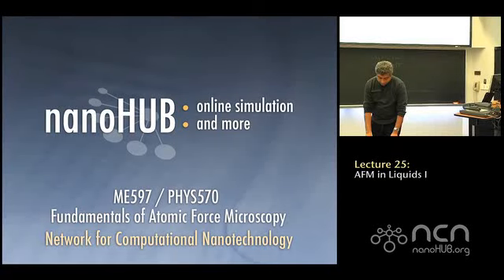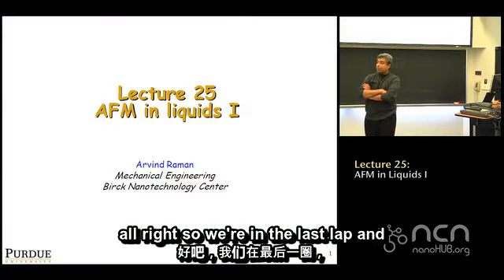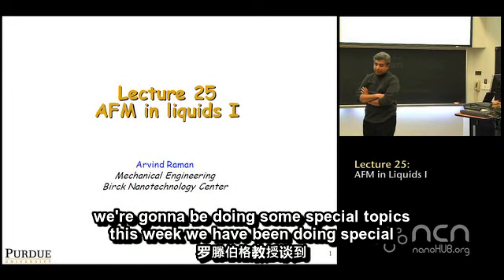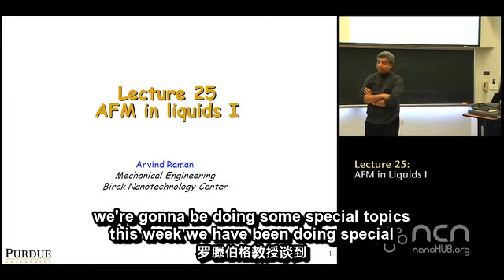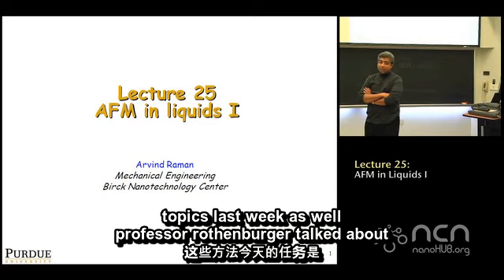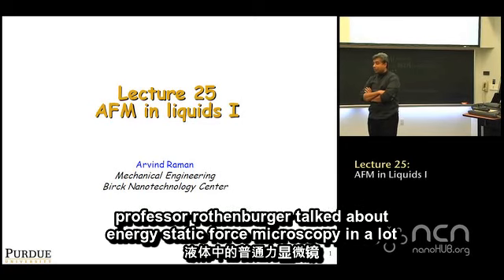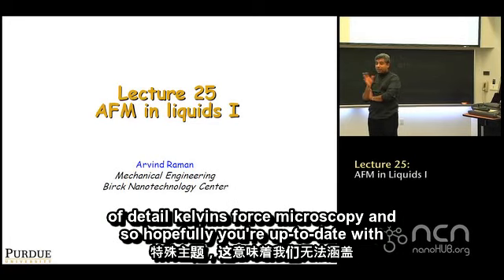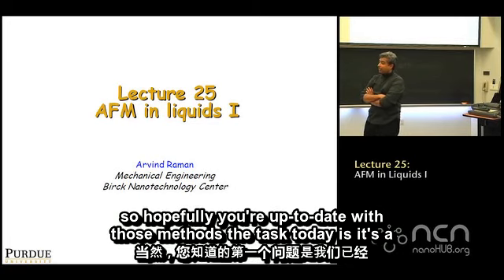nanohub.org. All right, so we're in the last lap, and we're going to be doing some special topics this week. We have been doing special topics last week as well. Professor Reifenberger talked about electrostatic force microscopy in a lot of detail, Kelvin force microscopy, and so hopefully you're up to date with those methods.